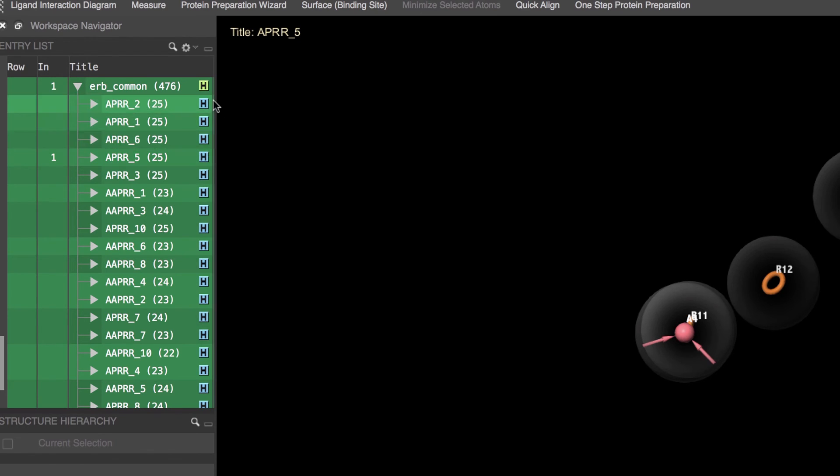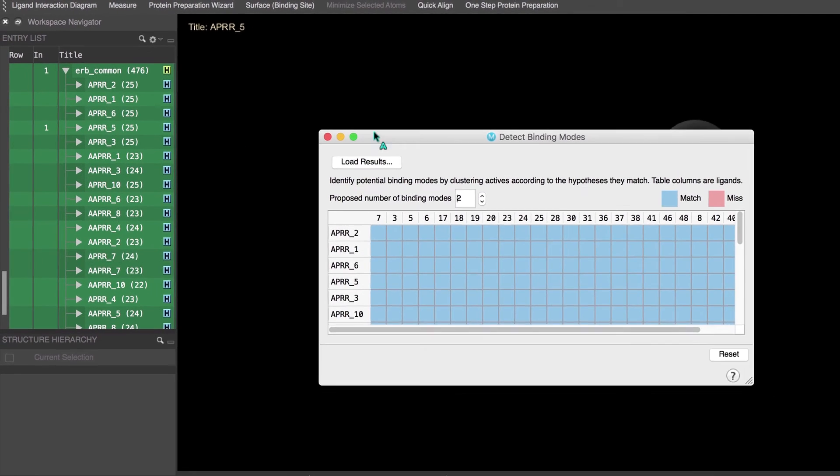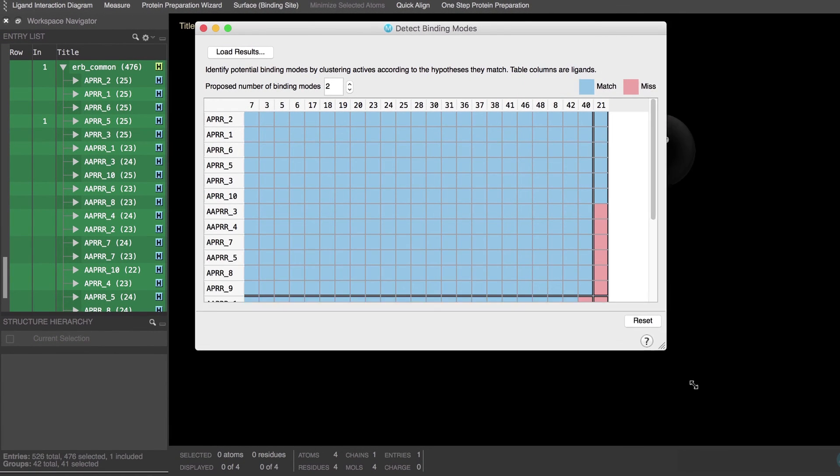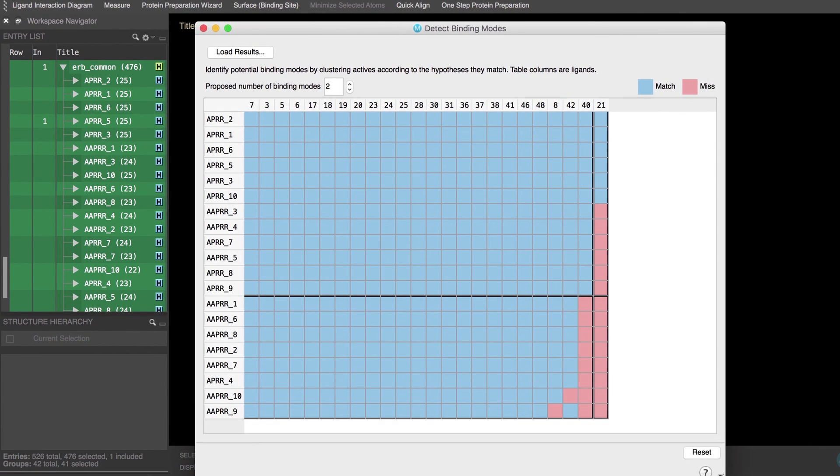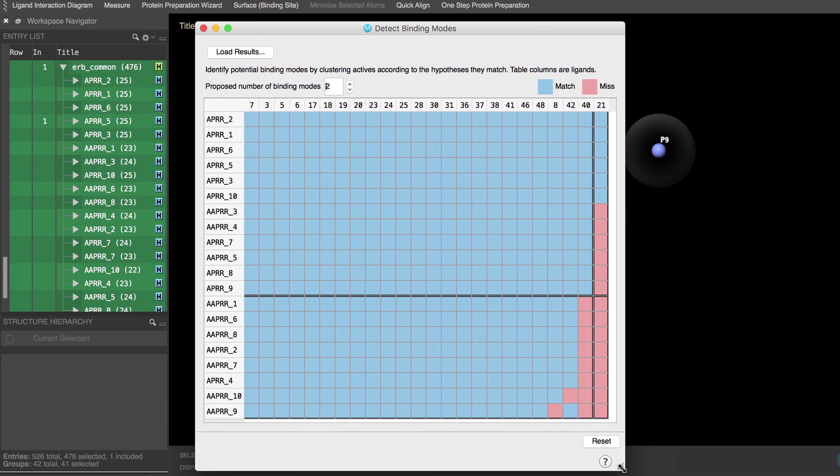While left or right clicking the green hypothesis H button reveals options relevant to all hypotheses such as determining whether multiple binding modes can be detected from the collection of hypotheses that were generated.